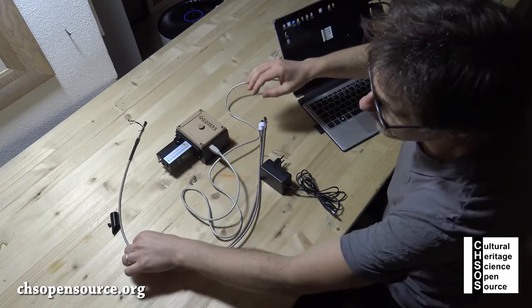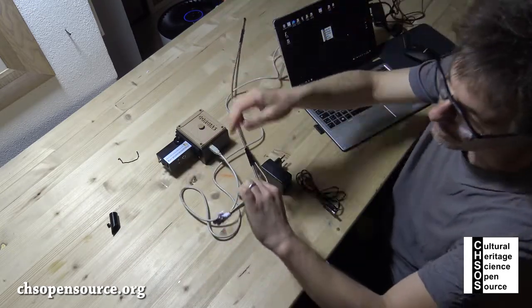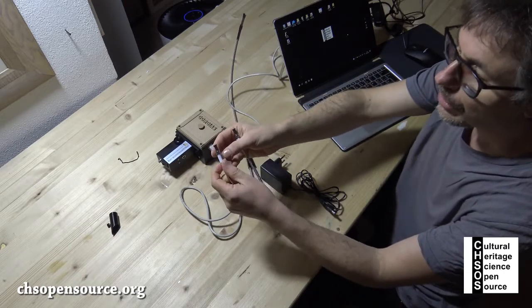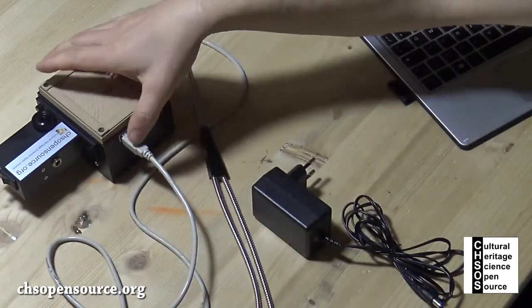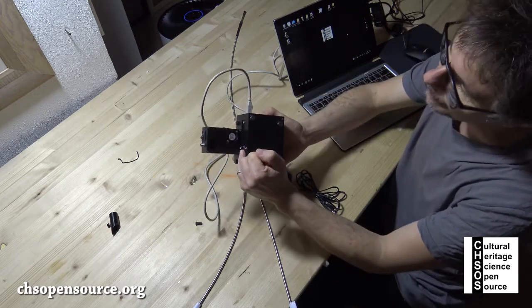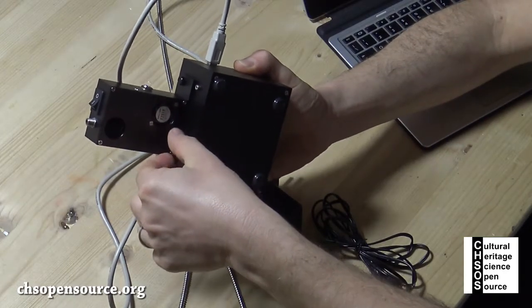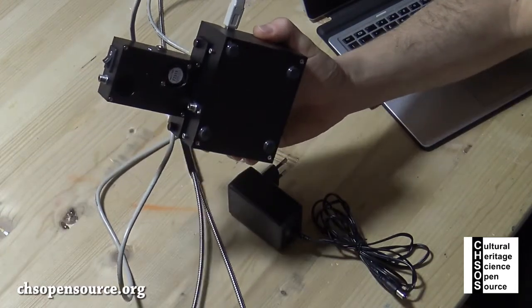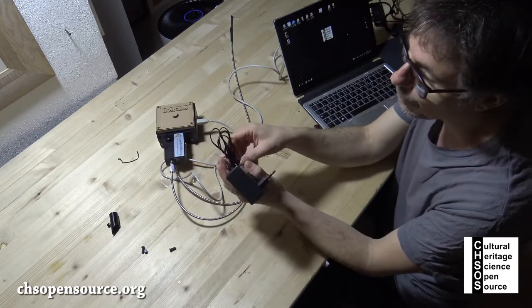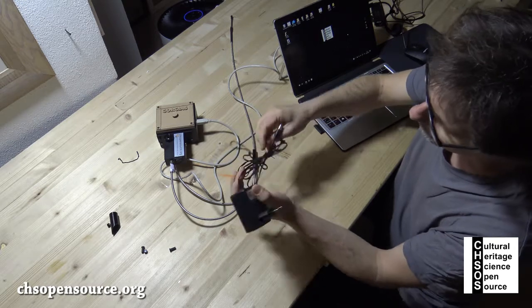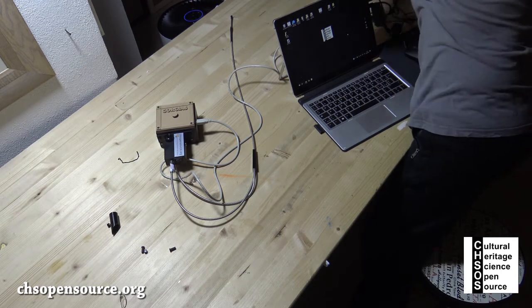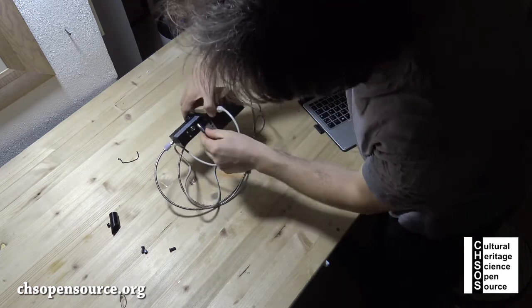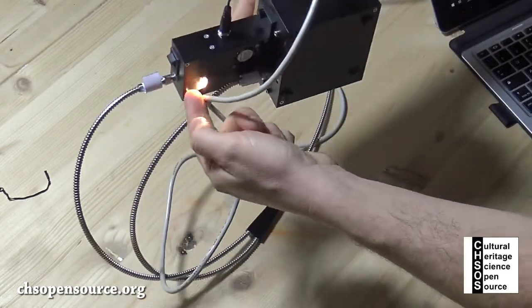Then we have the fiber optics bundle. This is made of two entrances. One has the label 'spectrometer'. This one goes inside the spectrometer which is over here. We unscrew this cap and put this spectrometer fiber inside. To use this fiber connector, just slide inside the fiber and then there is this ring to screw in position to fix the fiber.